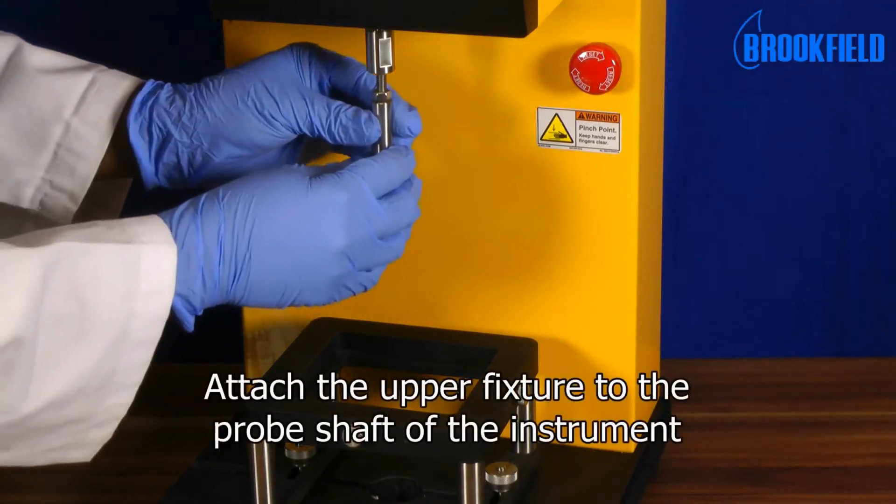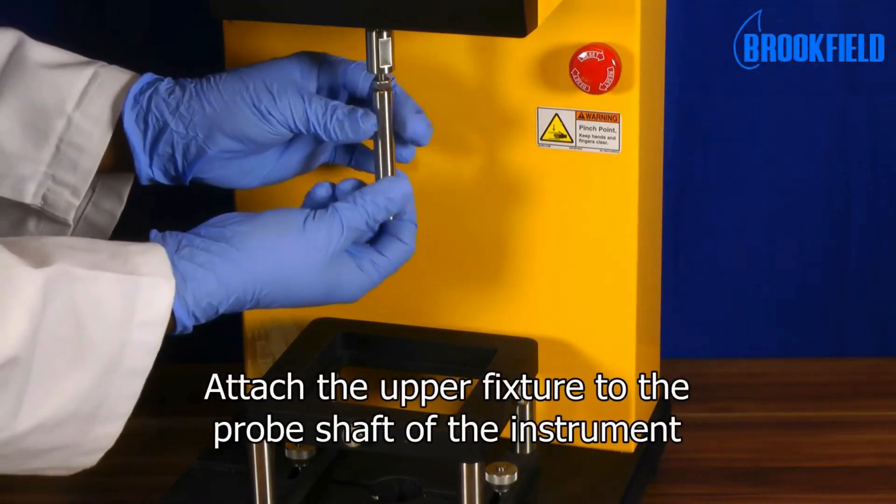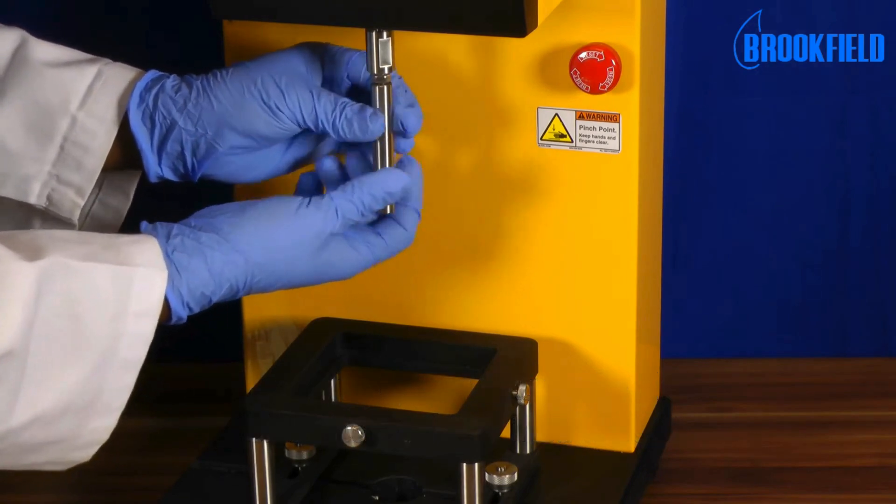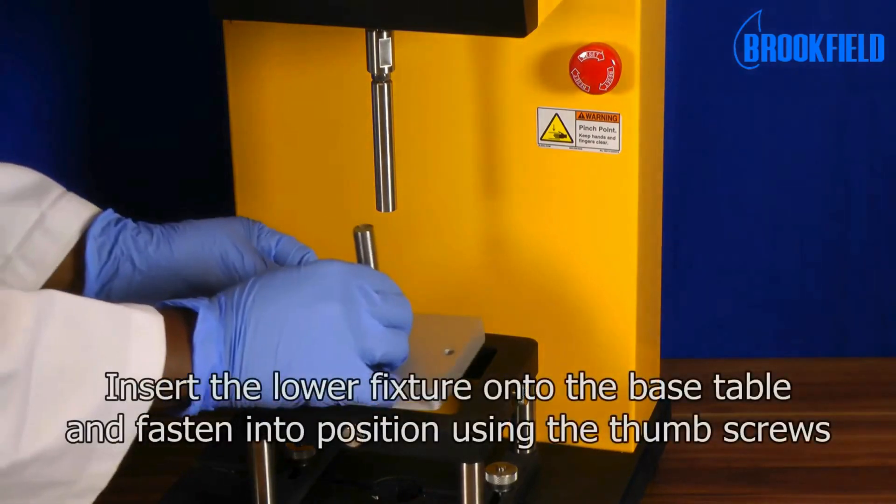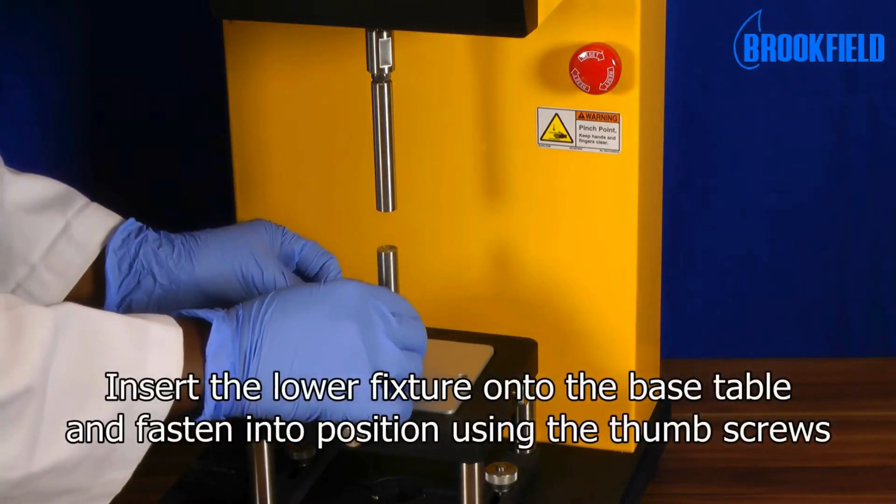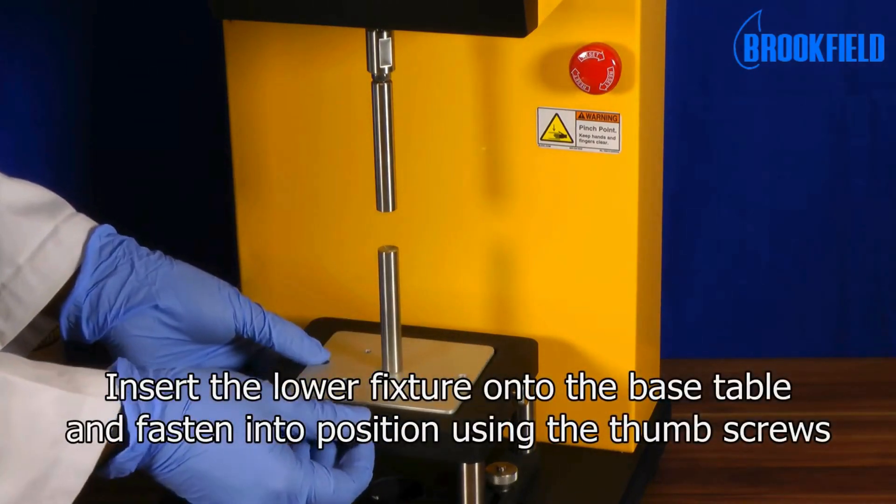To set up the test, attach the upper fixture to the probe shaft of the instrument. Insert the lower fixture onto the base table and fasten into position using the thumb screws.